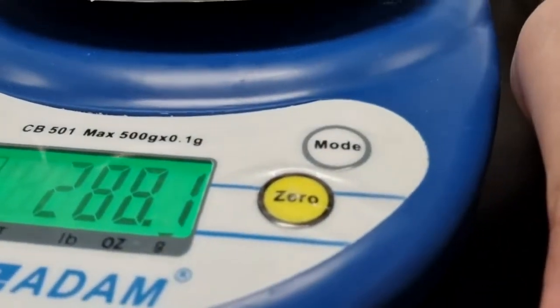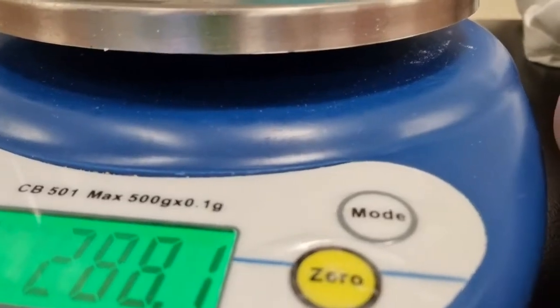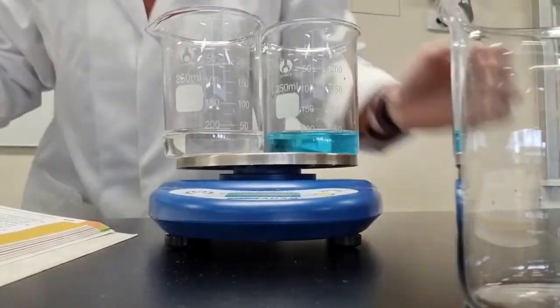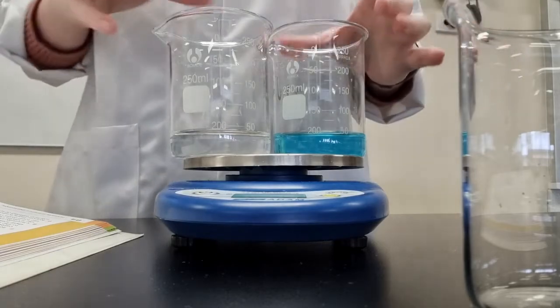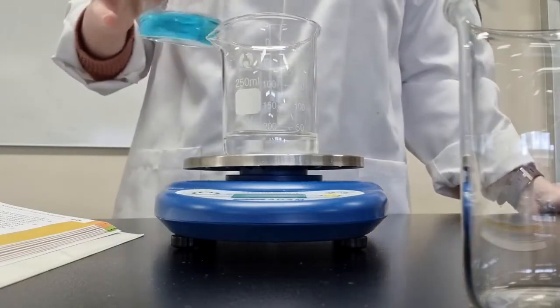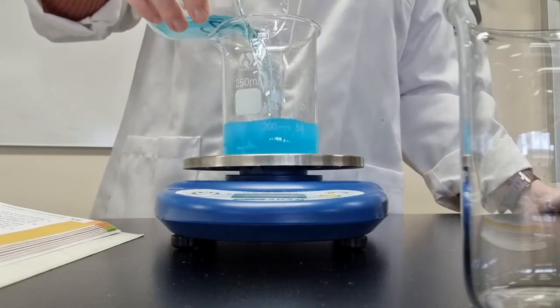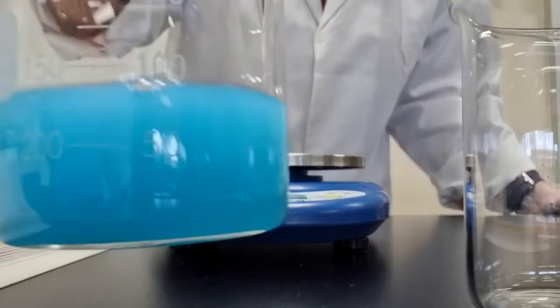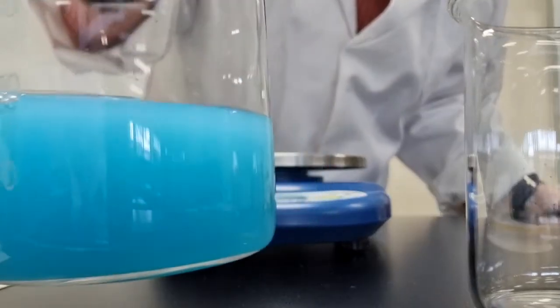288.1 grams. So that needs to go in your before total mass before mixing in grams. And again, I'm going to pour my copper sulfate into the sodium carbonate, and you need to observe what happens. You can see that. So we're getting a precipitate forming there. It's quite cloudy.